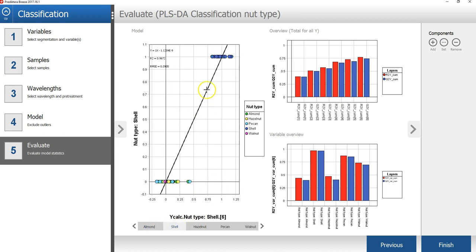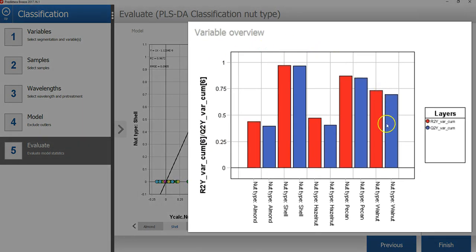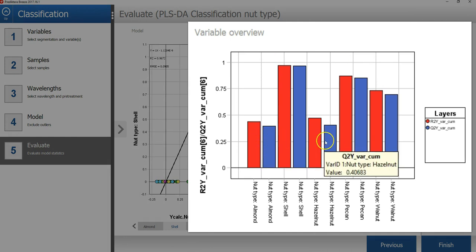For the shell class, we can see that we don't have an overlap with any other classes. The variable overview graph shows that the almond and hazelnut could not be as well classified as the other types.